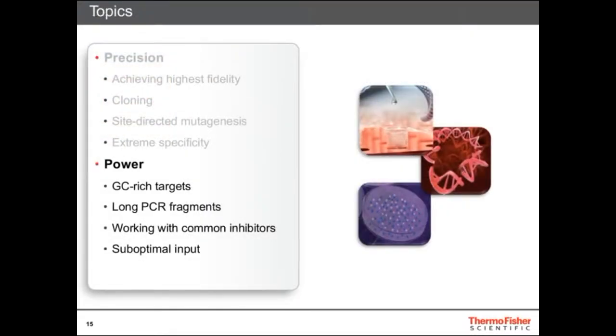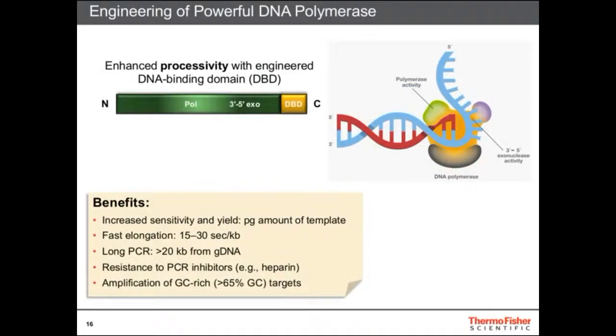So now that we've talked about key attributes of a DNA polymerase, we would like to show how we can use those attributes in our real experiments. First, I wanted to give you a little explanation about how we engineered this polymerase.